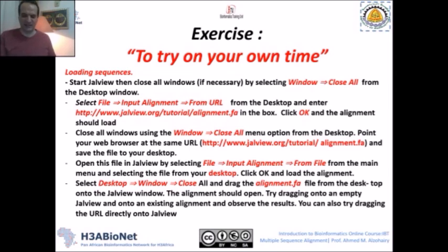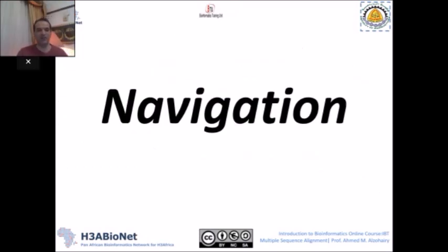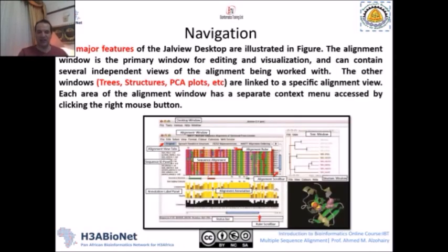As we mentioned in the last slide, navigation is a very good part of Jalview. With this navigation option, you can navigate within your alignment if you have a large alignment.